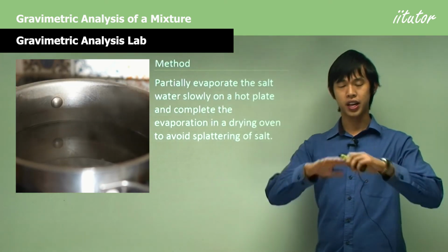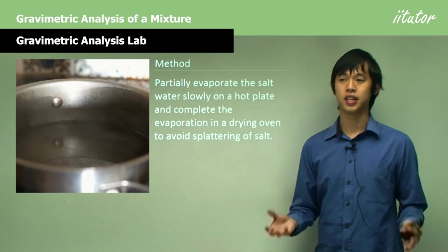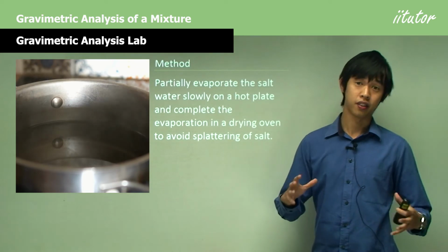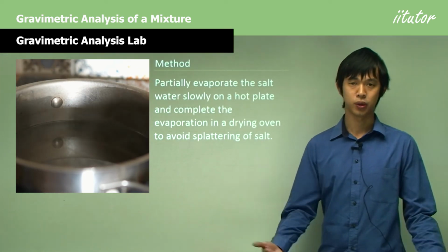The way to evaporate things has a bit of a technique to it. While I went through the overview of how to evaporate, just putting it in the oven basically, there is a bit of a technique to it, particularly if you want this experiment to be done in the space of an hour or so, which would be good for you to get the results in one class.